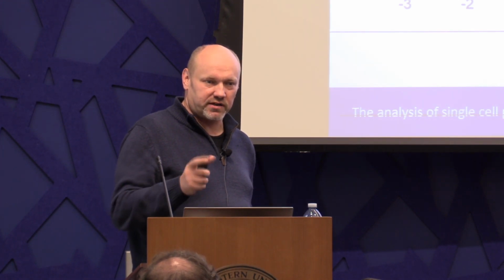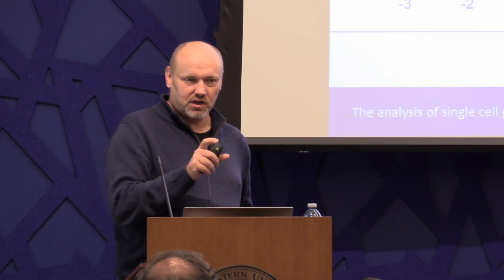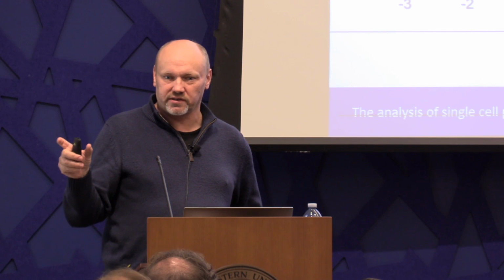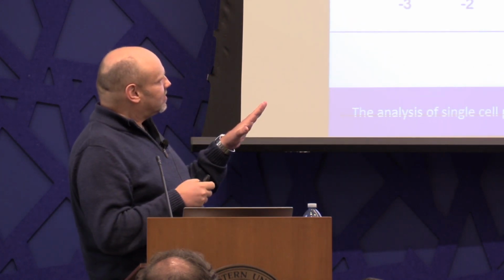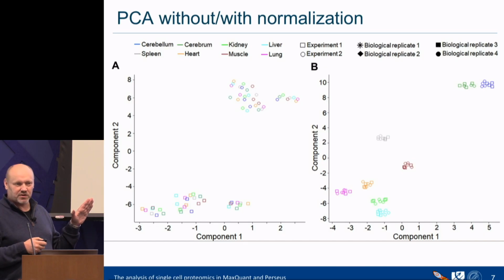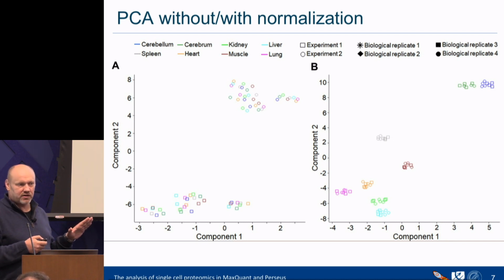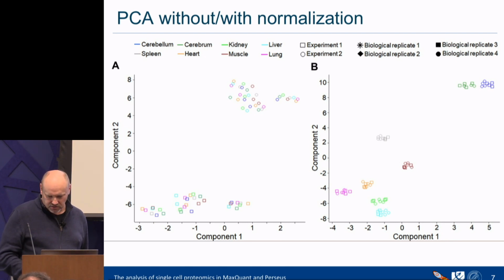They require that you tell them what the batch effect is that you want to remove, and also what the grouping is that you're interested in, and then it tries to orthogonalize this somehow, right? Here, even specifying the batch effect would have been problematic because we have two batch effects. So all this information is not given to the algorithm. Still, it has the best outcome possible, so that means that's probably the way to do it, and that's also how we want to do it.